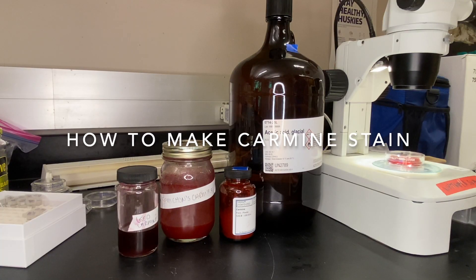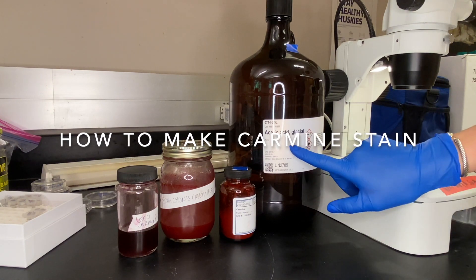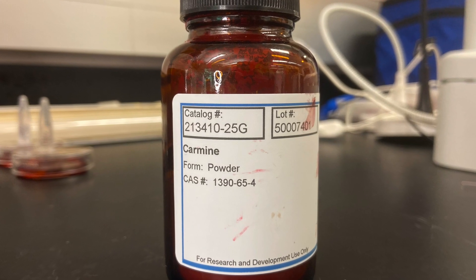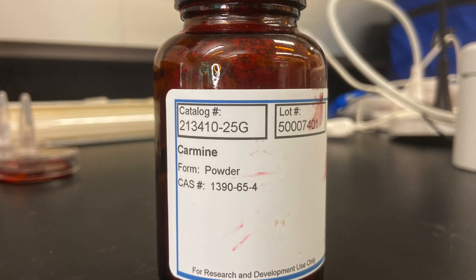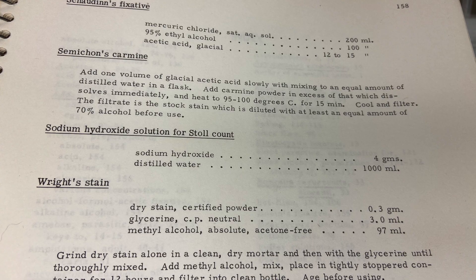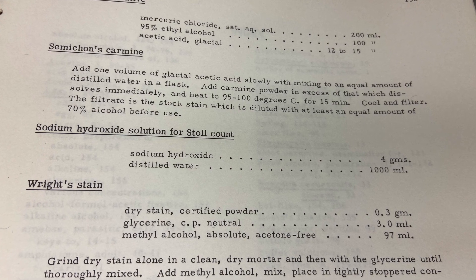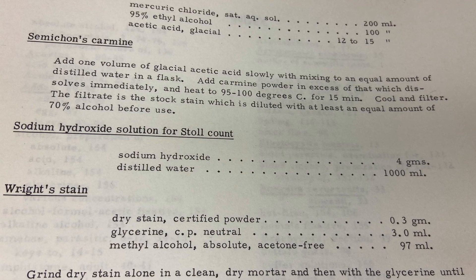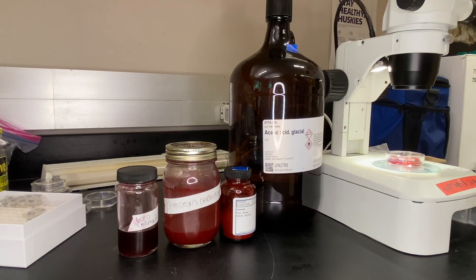To make this stain, we add one part glacial acetic acid with one part distilled water, and then we add carmine powder until it all dissolves — we'll make a saturated solution. I usually add a little bit more than what dissolves, and then I heat that over 95 to 100 degrees Celsius for about 15 minutes, and then pour that solution into a jar. I can reuse the stain across multiple specimens as long as it stays clean. When you go to add it to the specimens, I use a little bit of ethanol with the carmine mix.